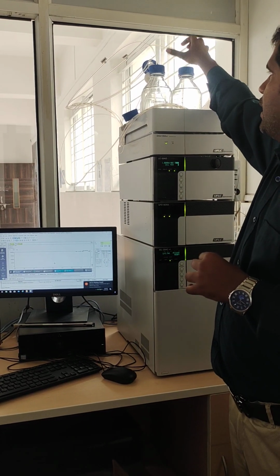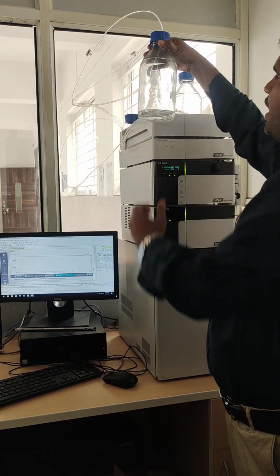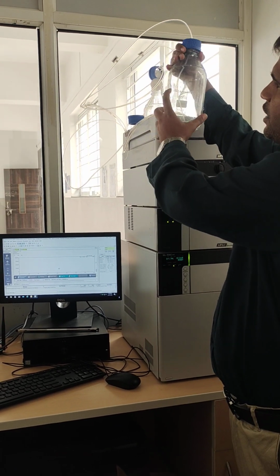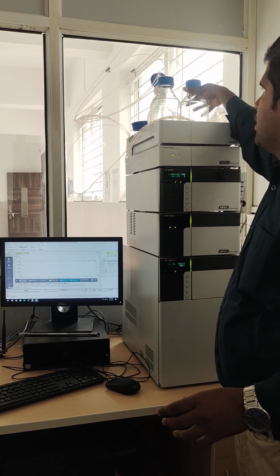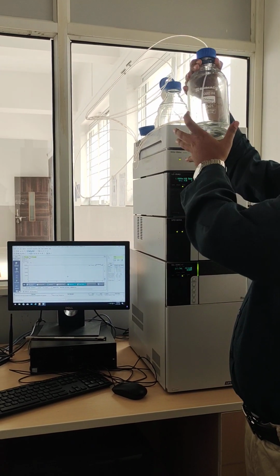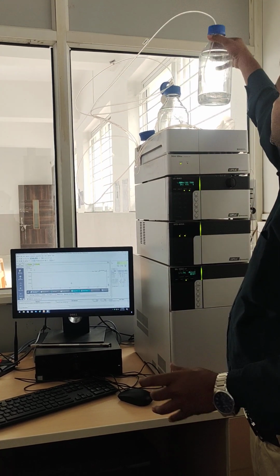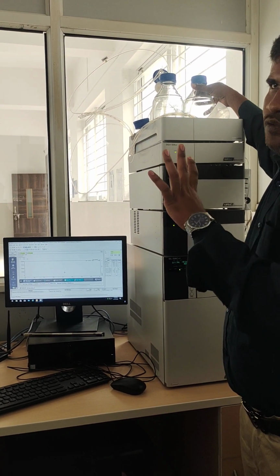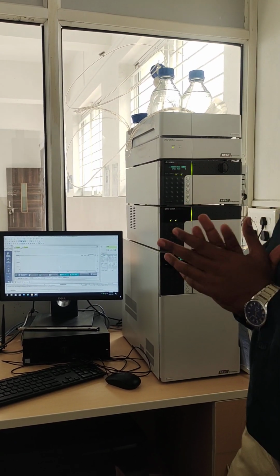In the A port I have added methanol. What have we added? Methanol. Here I have written methanol, isn't it? And in the B bottle I have added water. What have we added? Water. Isn't it? Only 2 ports I will use, so the remaining ports I have kept in another section.